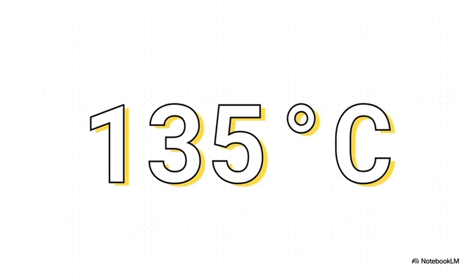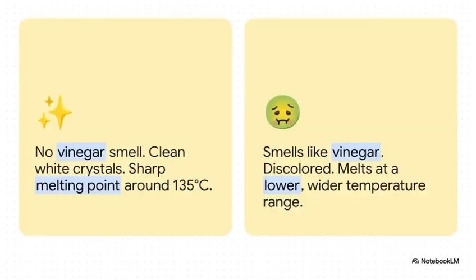It's a simple test, but it's an incredibly powerful quality check. And the difference is something you can literally see, smell, and measure. Pure aspirin should be clean, odorless white crystals with that sharp melting point. An impure product, though, might still have that faint smell of vinegar, it could look a little discolored, and its melting point will be kind of mushy and lower than our 135-degree target.